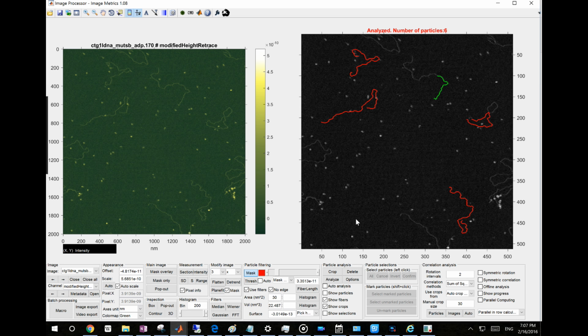So when you are at this stage, you can show selections, and this opens a door to a number of operations. You see here, you can select particles, various operations, and you can also mark particles. For example, to mark the particles, you press Shift on the keyboard and then click the particle. This basically masks a circle on the particle, and it's a manual filtering method.